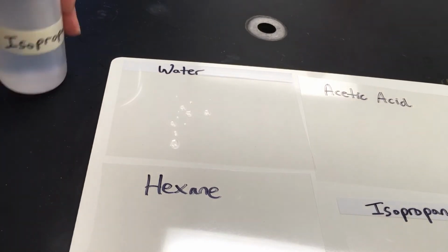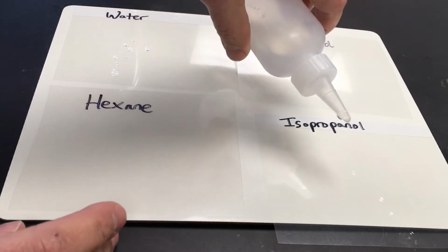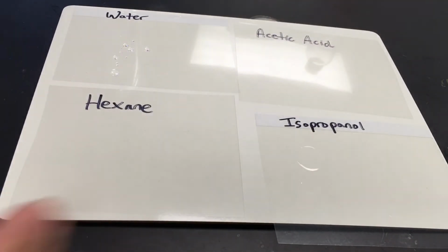Let's check out some isopropanol. Look at that. That is what we call a flat sheet, right? That did not form a droplet.